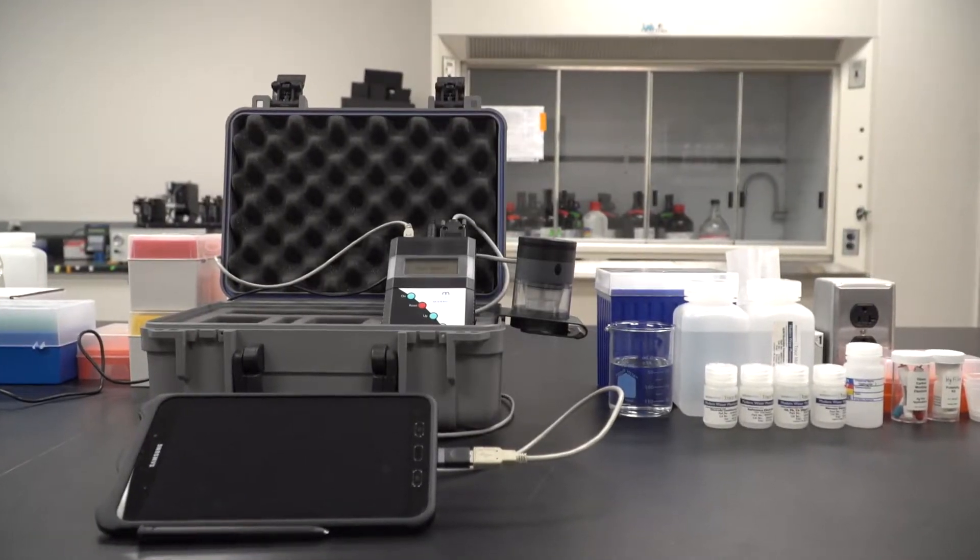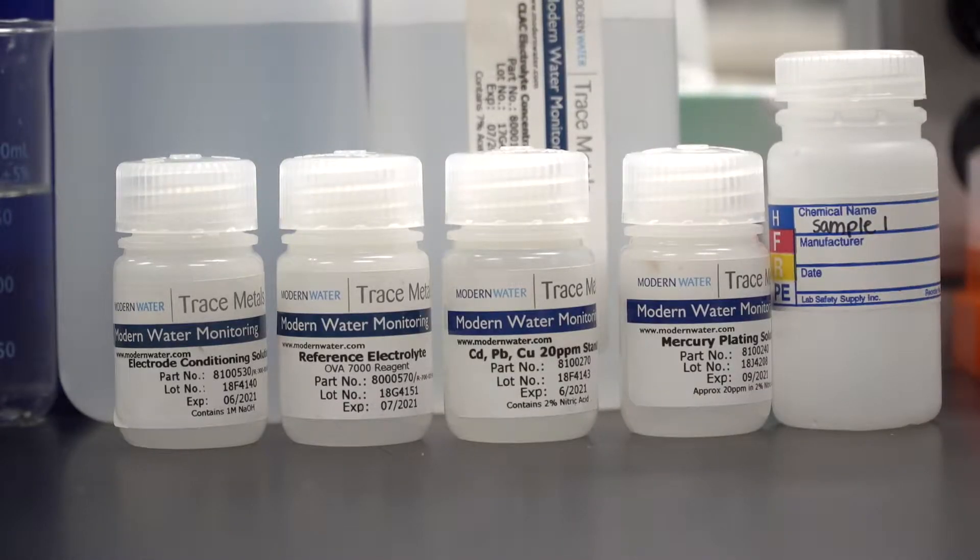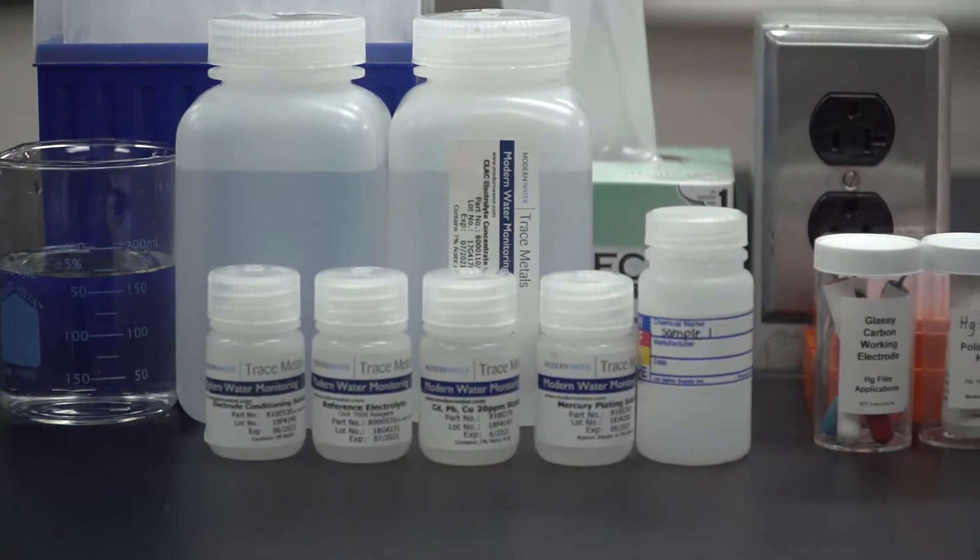The Microtrace PDV is a portable analytical instrument capable of detecting and analyzing over two dozen metals down to low parts per billion or sub parts per billion levels.